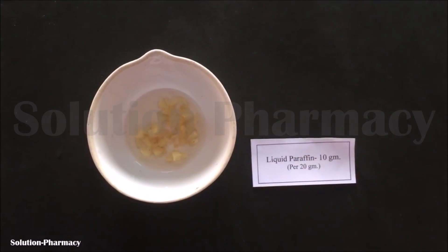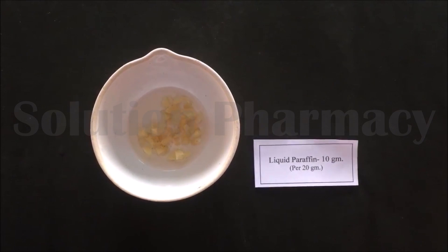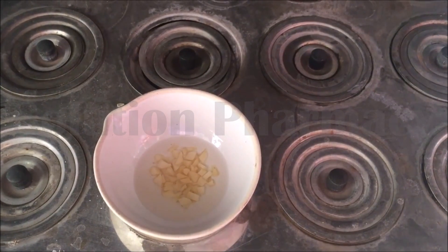The next ingredient is liquid paraffin — we have already weighed about 10 grams — and then transfer it into the same china dish containing beeswax. Liquid paraffin is a mineral oil. One of the important factors of skincare is to preserve and maintain the moisture of the skin. Liquid paraffin makes a layer on the skin and acts as a barrier to prevent loss of moisture, and because of this moisturizing property it is also a common ingredient in eczema preparations.